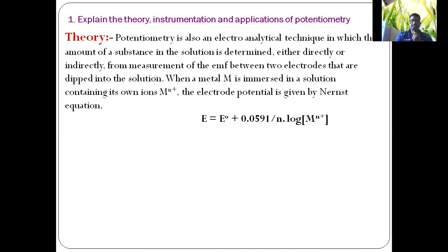Potentiometry is also one of the electroanalytical techniques, as we categorized in the first session, in which the amount of a substance in the solution is determined either directly or indirectly from the measurement of the EMF between the two electrodes that are dipped in the solution.